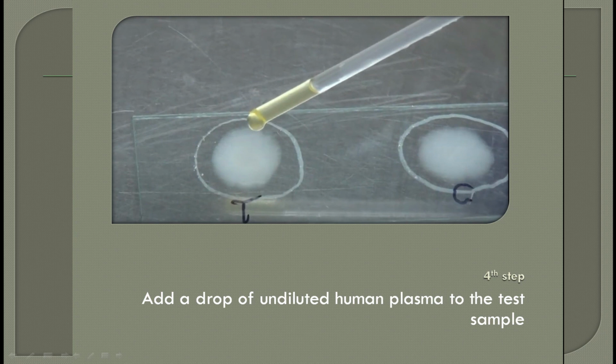We do not add the plasma to the control, because that is the entire point of a control, that you do not actually replicate everything that you are doing in the test. You are only seeing if the reagents themselves give any reaction or not. That's what a control is meant for.